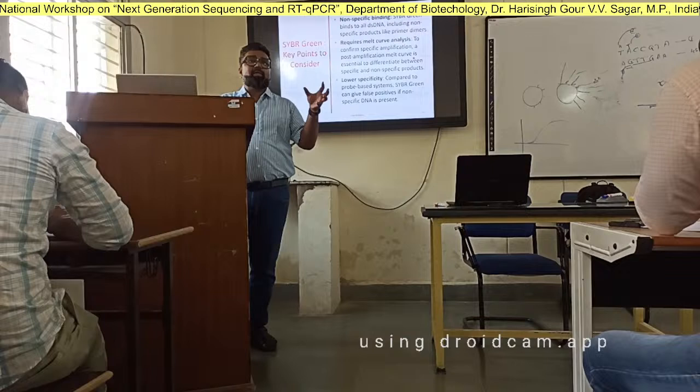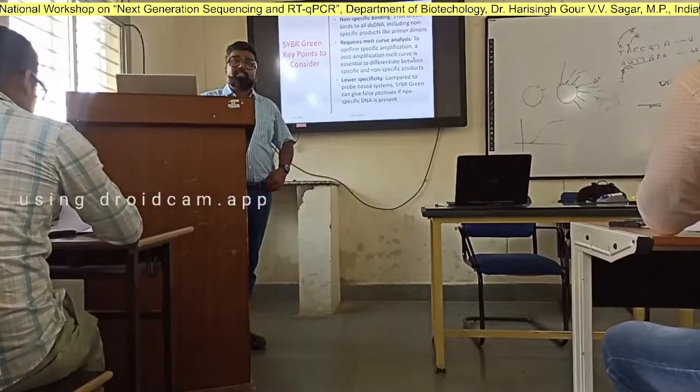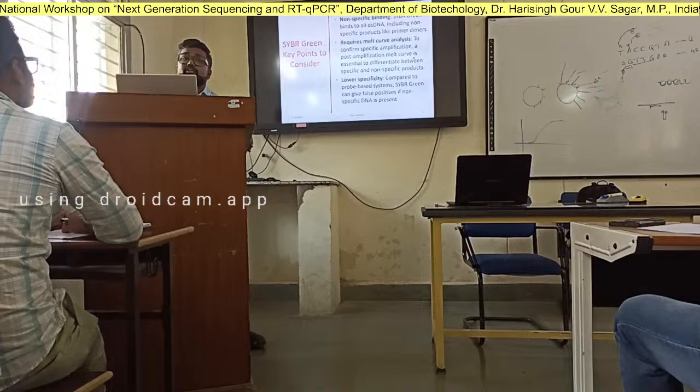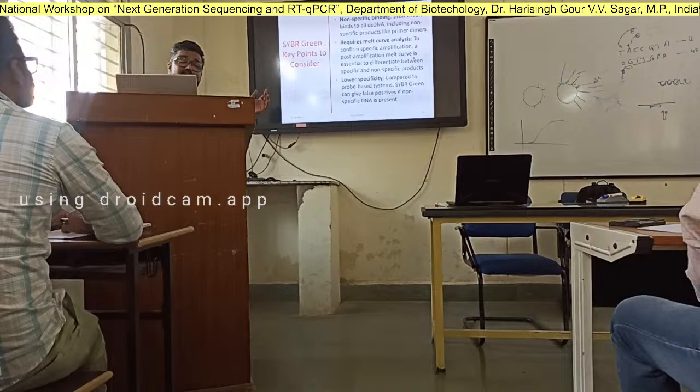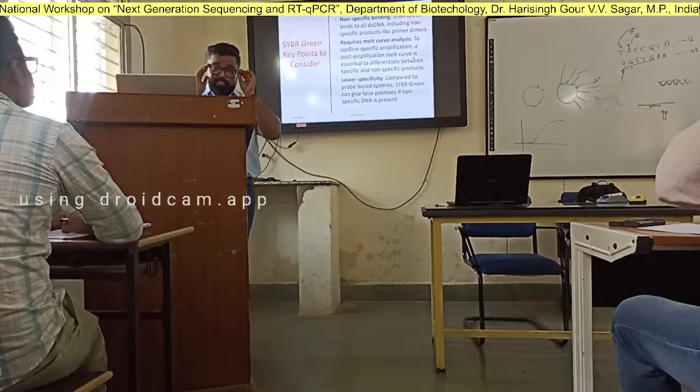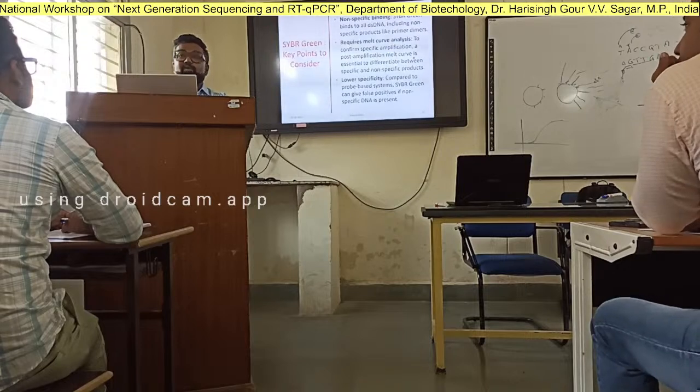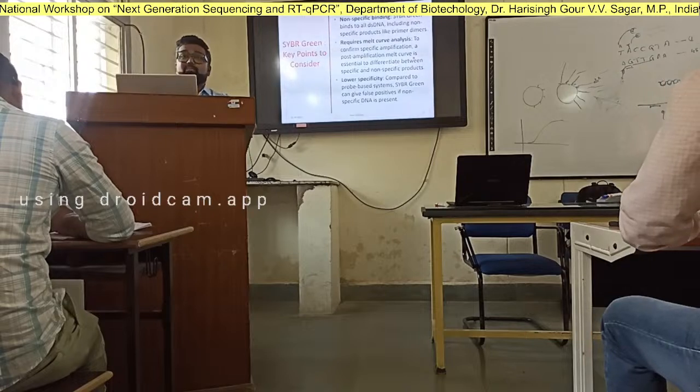Then even samples that were not infected would show signal, because you are detecting something that is non-specific. So that part of my lecture is: always verify it. Look at the DNA pattern, and if possible, treat this as a standard, do sequencing.